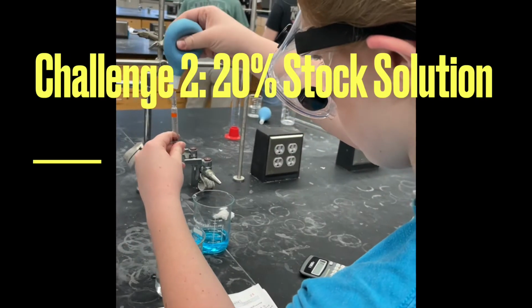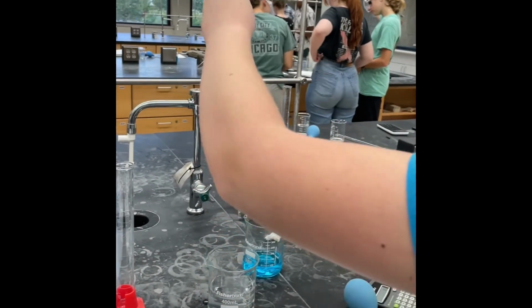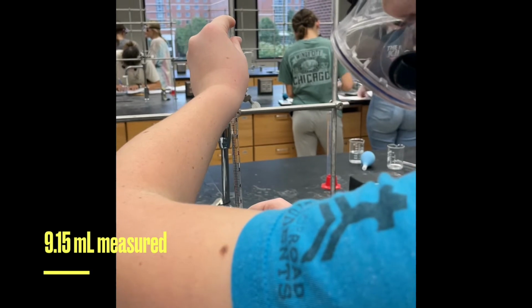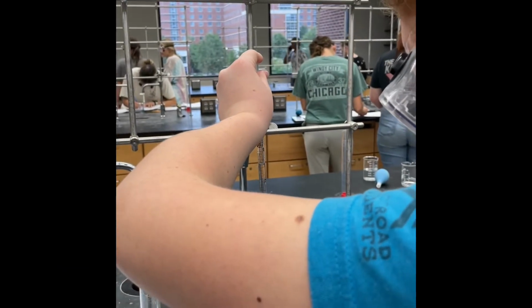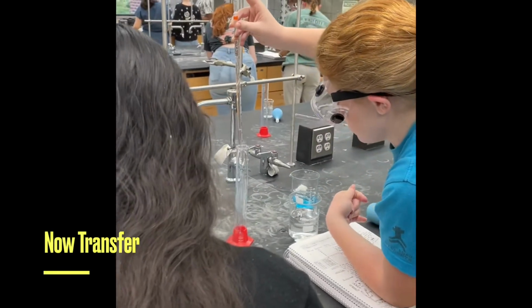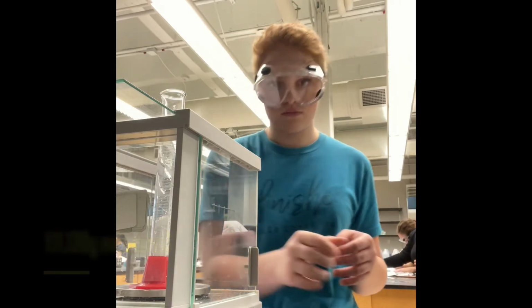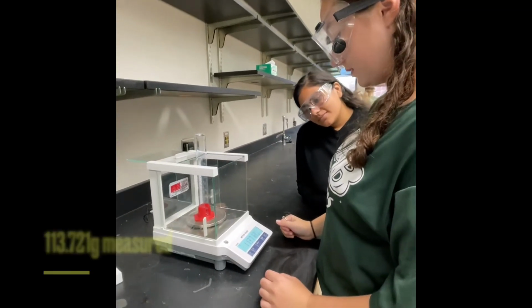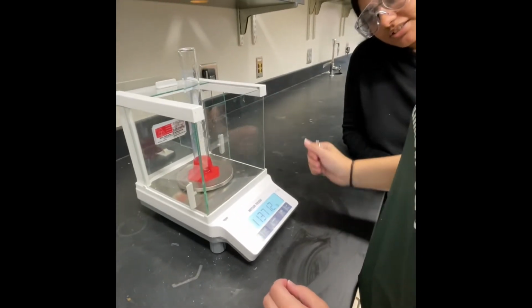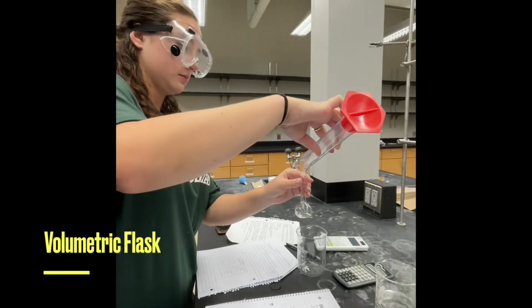In the second challenge of the experiment, we were trying to find the density of now 20% stock solution. The pipette allowed us to determine the most accurate measurement of milliliters. It was important to record the initial and final volumes to correctly perform this calculation. In this challenge, we measured the volume multiple times to collect our data. Then, we weighed it on the scale. Here, we got 111.134 grams. Here, we are using the volumetric flask.